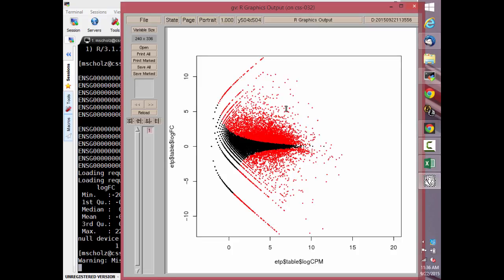So it actually didn't change much, but the lines are a little bit curvier. I can't tell you exactly what changed in the way that it's calculating things, but it did calculate things slightly differently. The numbers are still mostly the same, but it is actually kind of nice because this one gives us a nice example of something with a very extraordinarily low fold change that is inside of these, but is actually still red. And these are the ones that are outliers that would never be caught if you were going to do a simple fold change analysis. And may in fact be the same one that we were looking at before, from the smaller data set.